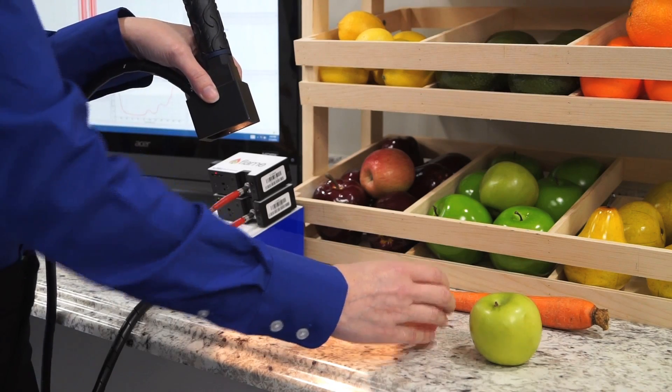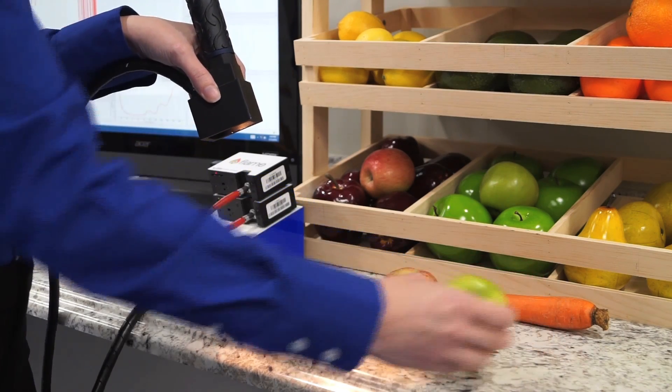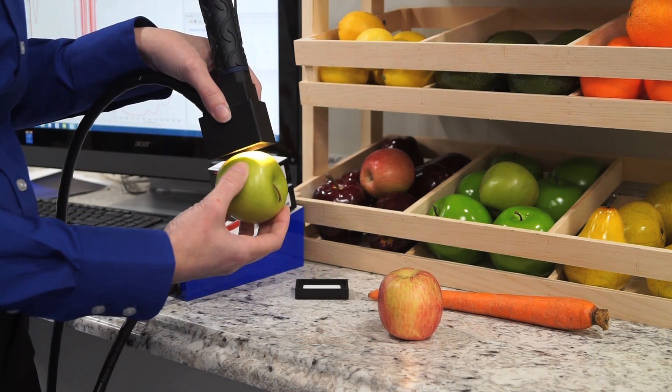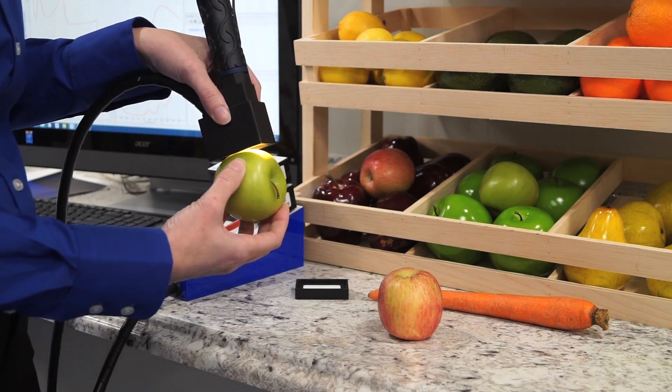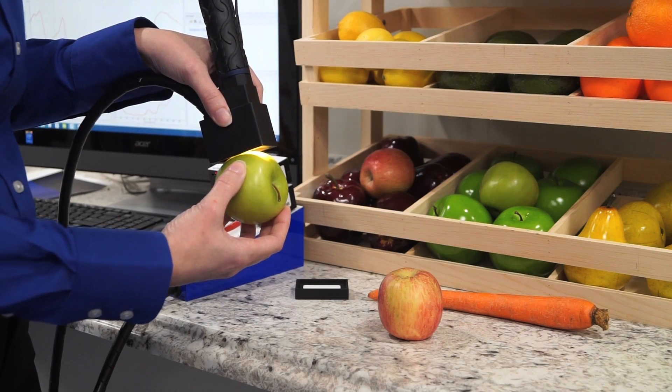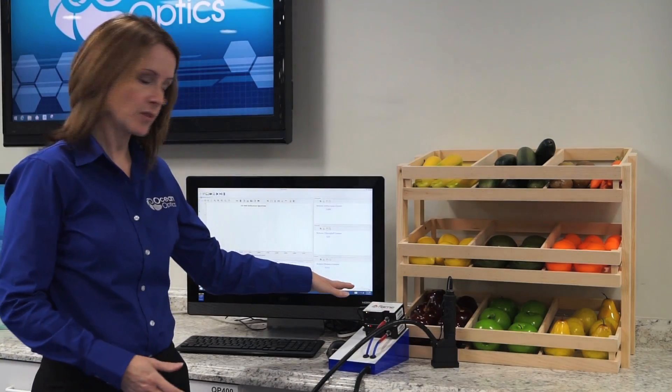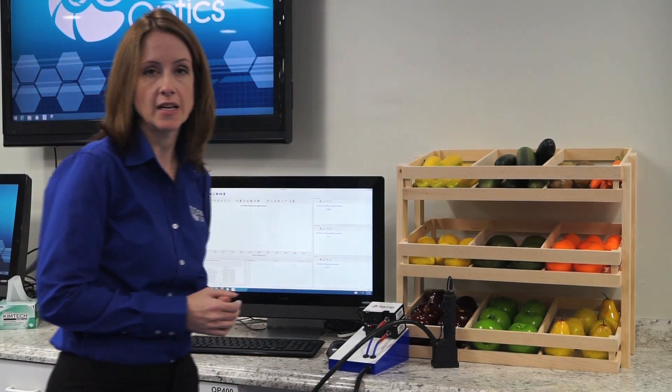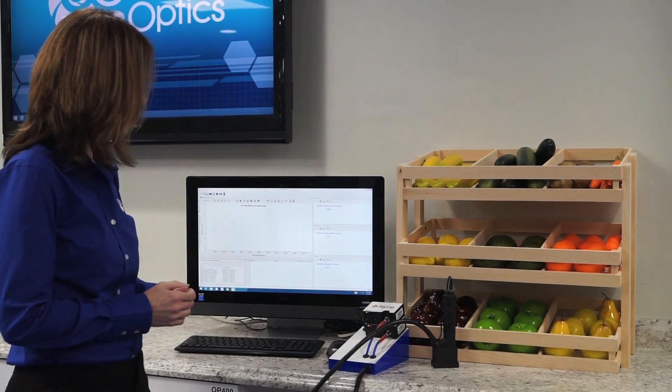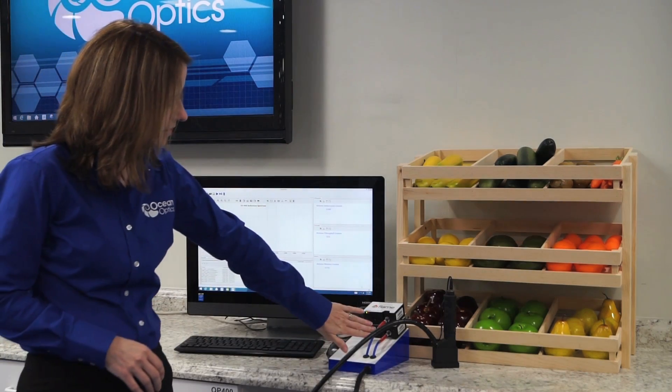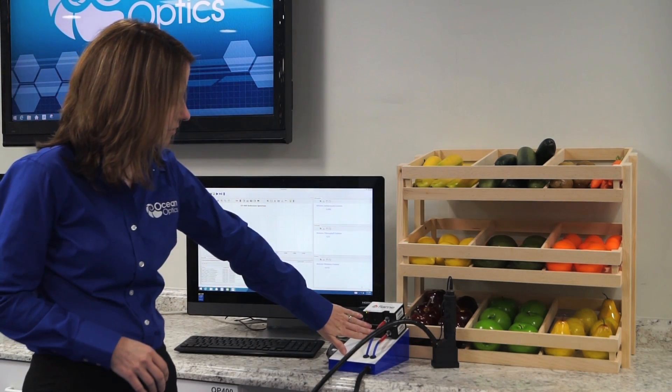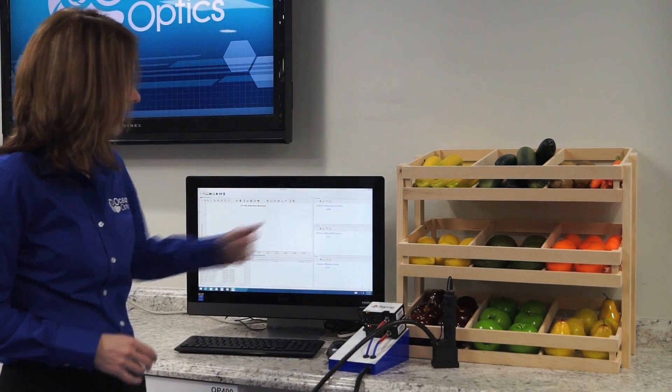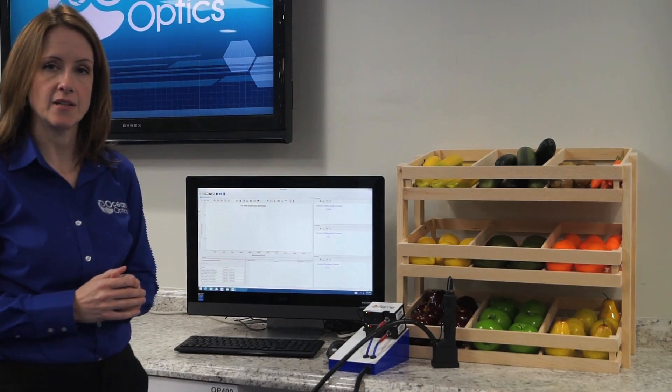The tungsten halogen lamp shines visible and near-infrared light onto the surface of the fruit or vegetable, and reflected light is carried back to the spectrometer. One is a visible spectrometer covering 400 nanometers and upwards to the near-infrared. The second is a near-infrared spectrometer that extends the range out to 1600.